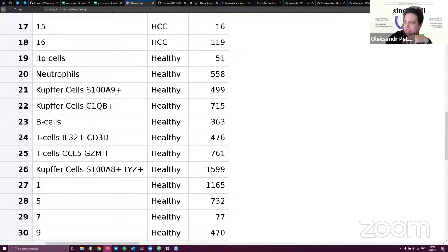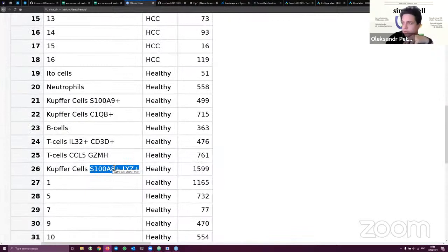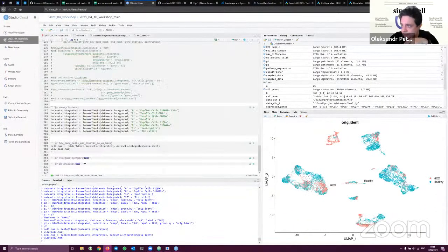If you imagine that this is a new cell population never described before, you can now try to develop a protocol for flow cytometry sorting related to these markers, if it's possible, if there are surface antibodies, etc., and calculate more precisely how many of those there are. That would be one of the outputs of this analysis.